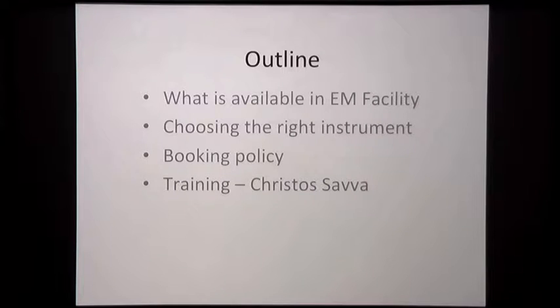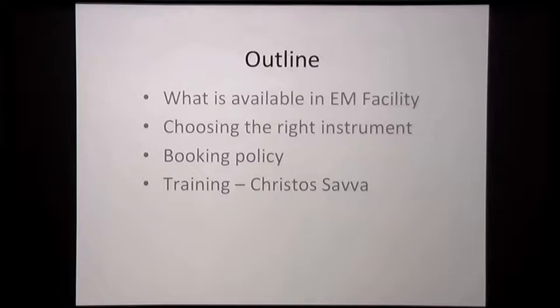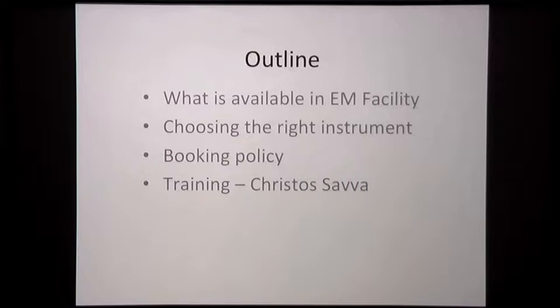So this will be the outline, the slides I'm going to talk about. This is some of what really happens in everyday life here. I think it's good for people to have an overview of what we have, how you choose the right instrument, how to book the facility, how to access it, and how to get the training. With all this policy and knowledge, I think you can make your dream in LMB become true.